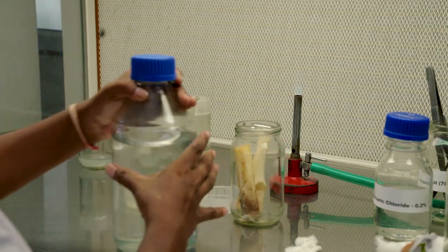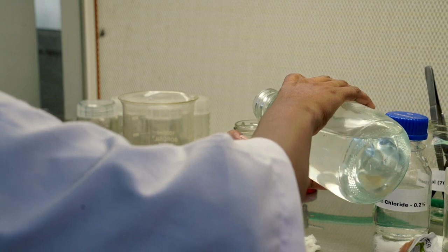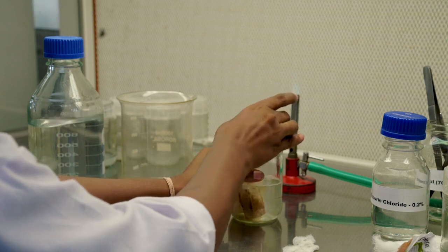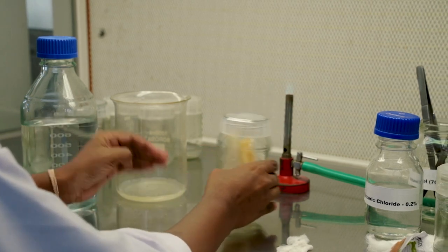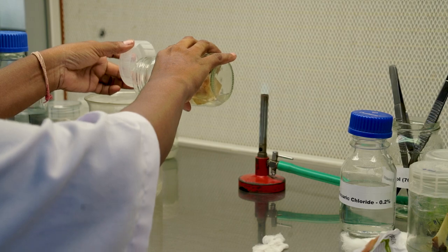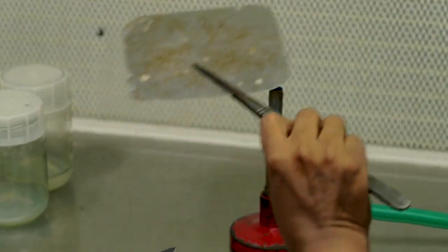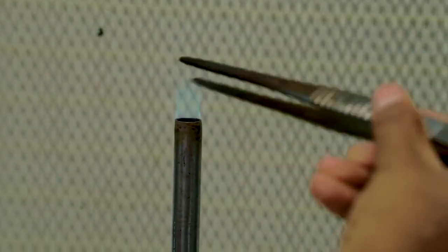This will be washed with RO water, or one can use double distilled water, sterile double distilled water. It is always better to use sterile water. This washing process has to be carried out 3 to 4 times. Now we will show you the process of sterilization of the forceps and the blade.